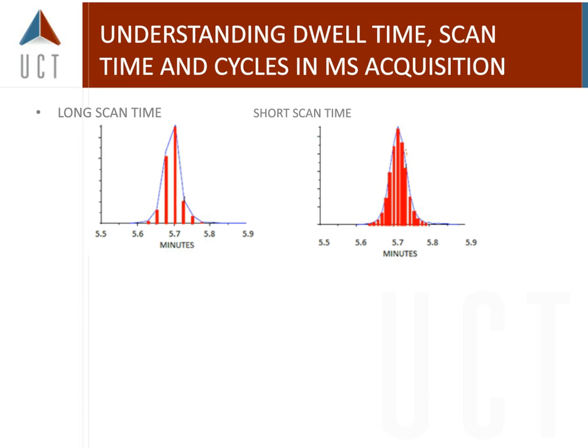Why I'm putting so much emphasis on this is because good chromatography will give you a better indication of how your extraction might be working. So you can't always assume, if your instrument isn't optimized, that there's a problem or you've created a problem with your solid phase extractions or any of your extractions. I've seen many times when people think that the application didn't work, and then they actually blame the extraction.